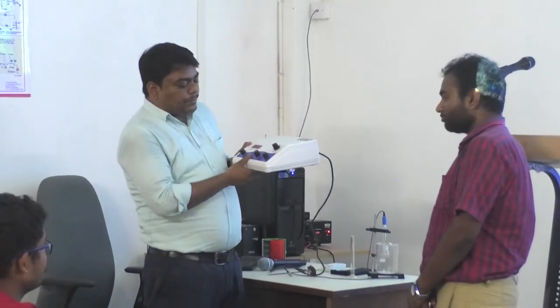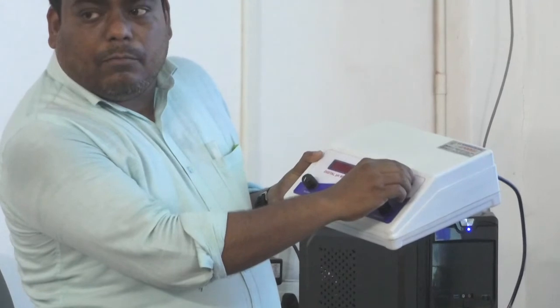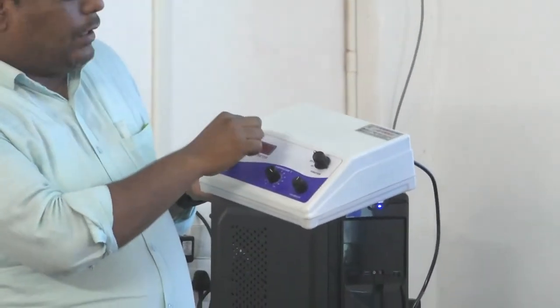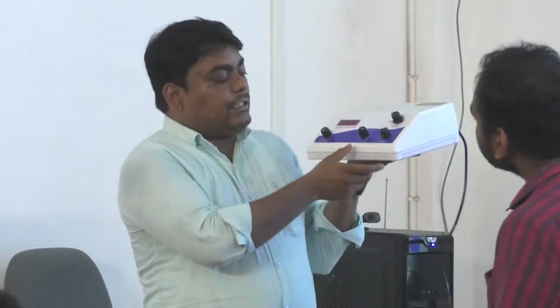We have three knobs here. The first one is pH meter, second one is standby, third one is voltage. And we have the first knob to calibrate the machine. Calibration is important. For calibration we have taken two standard solutions, which means we know the pH of the solution. That is called standard. Standard means what? It is a control.